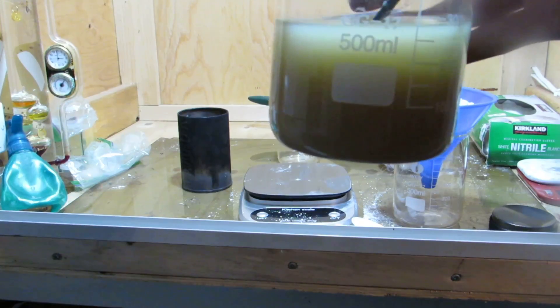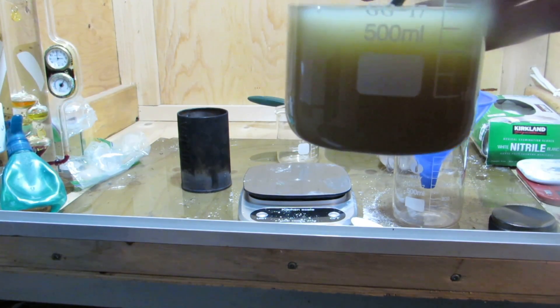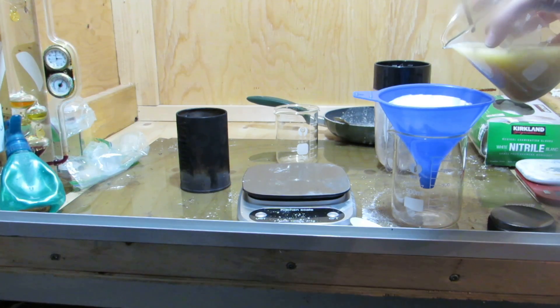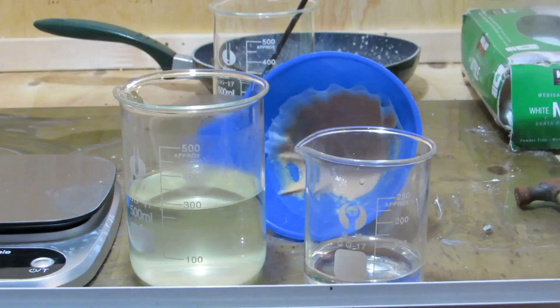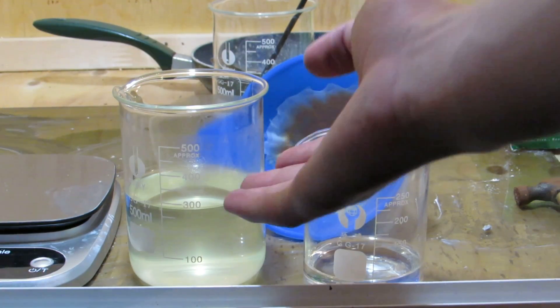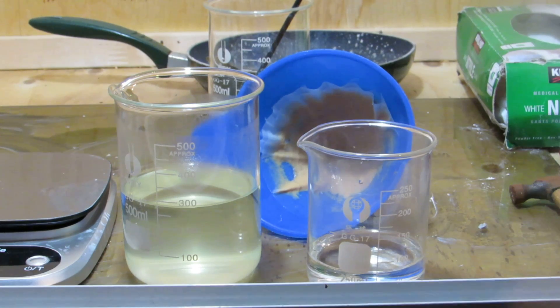The mixture was then filtered to remove insoluble impurities. The resulting sodium silicate solution was nice and clear. So next 75 milliliters of hydrochloric acid was added to the solution. This could be purchased as muriatic acid from hardware stores.